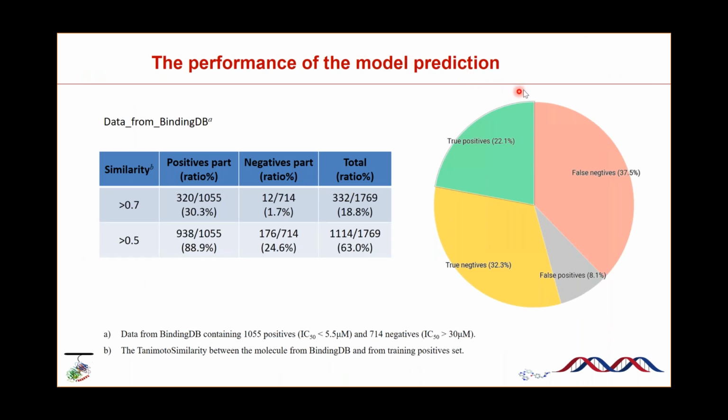I'm sorry if I missed it. Does the DNA fragment and linker affect target binding in a screen assay? If yes, how is it possible to overcome it? So basically, the linker. Sorry, I didn't catch that question. Could you repeat that? Yeah, sure. The question is, does a DNA fragment and the linker affect binding in the screen assay?